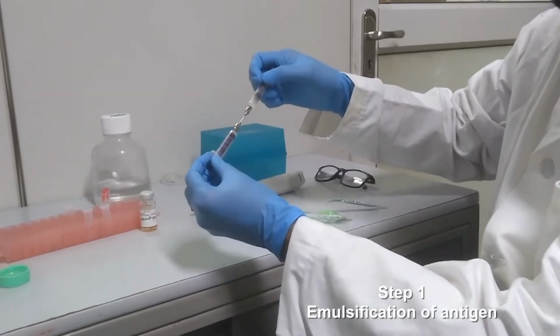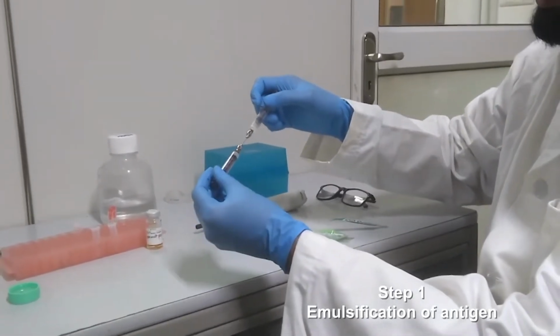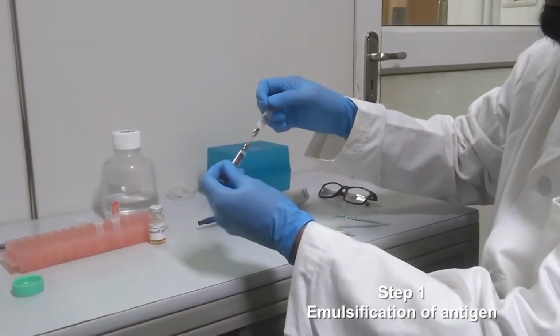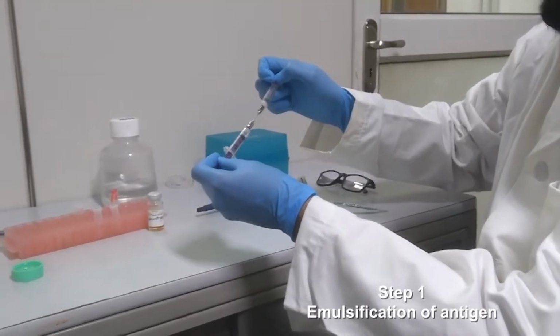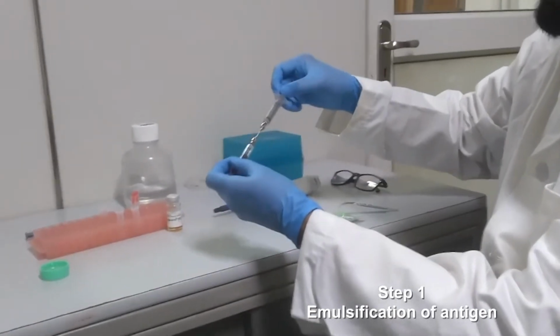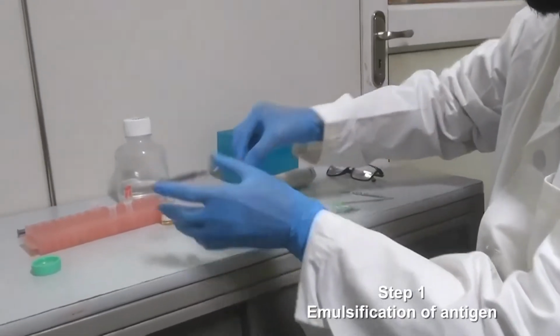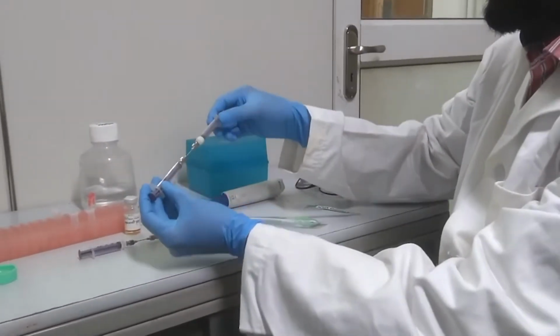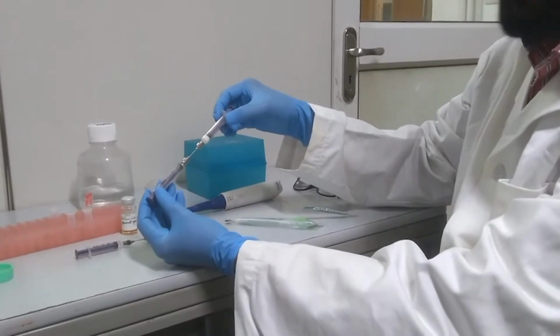Emulsion can be called water in oil or oil in water, because both are in the same concentration, same volumes, so you can call them either way. So by this method the emulsion is formed. For ready reference, we have already prepared the emulsion. This emulsion looks white.